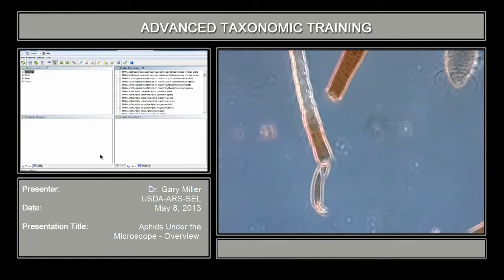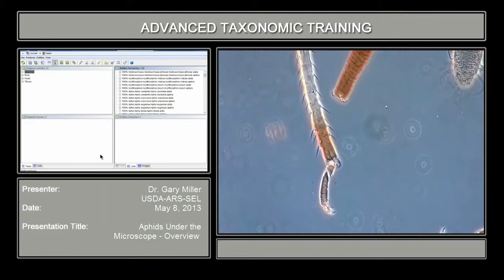Another structure that you may encounter for diagnostic purposes is the length of the second tarsal segment, measured from this point to just before the claw. Other diagnostic features are also found on the first tarsal and the number of chaetae (CD) that sometimes occur in that area.